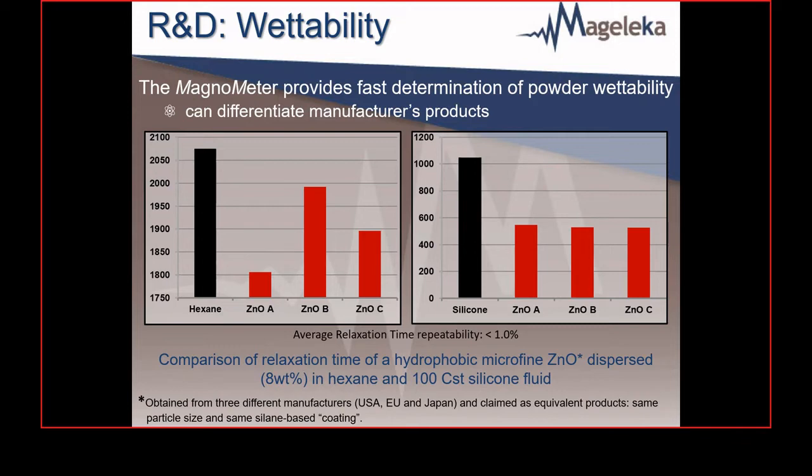So you can get a whole variety of these silanes, and they're often used in a lot of things as what's called coupling agents. But here, the zinc oxide itself was used in the formulation of sunscreen products because it's an efficient absorber of UVA and UVB. In its natural state, however, it's hydrophilic, can be wetted by water.